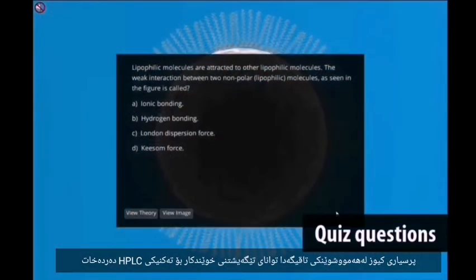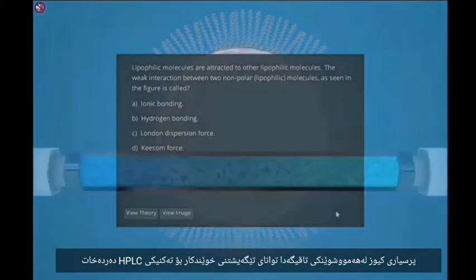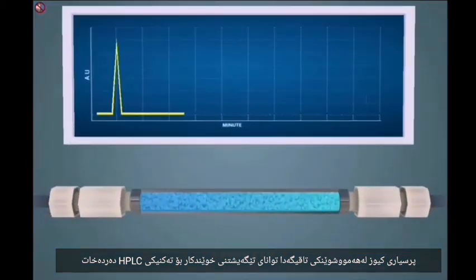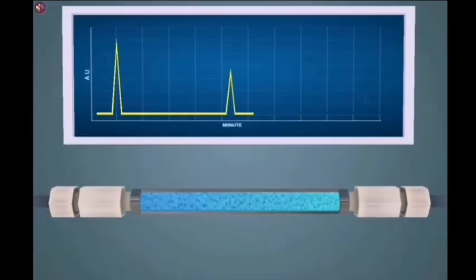Quiz questions throughout the lab check the students' understanding of the HPLC technique.